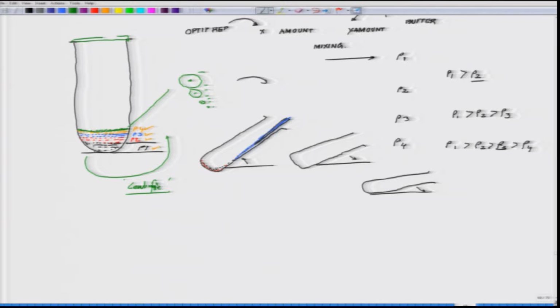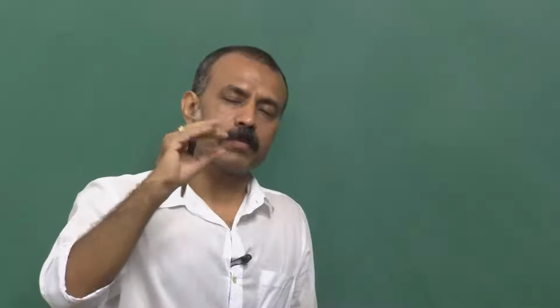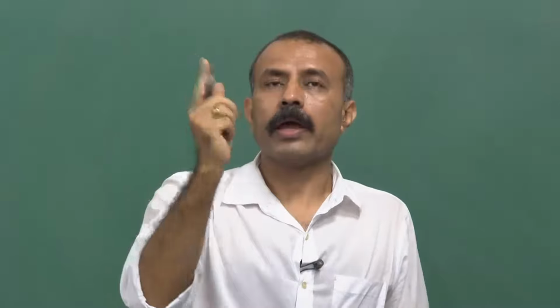Please be cautious that this topmost cellular layer has to be an exceptionally narrow band. There are people who recommend a thicker band, but over the years I have realized that really does not work, and you spin it.